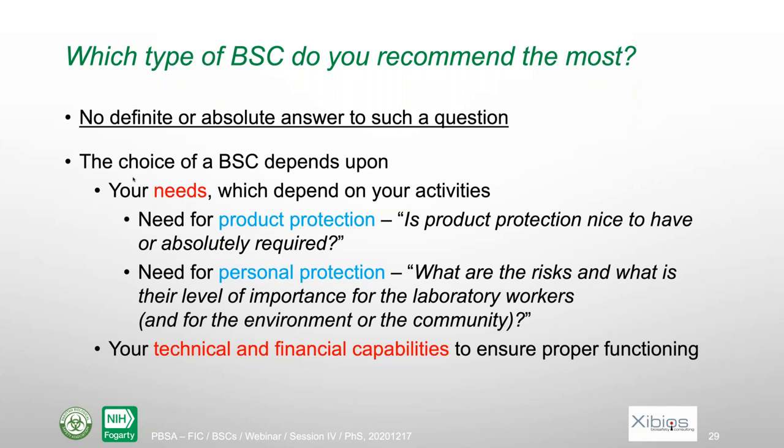And if you answer those two questions, you will have a better idea of what type of biosafety cabinet you will have. You also need to consider your technical and financial capabilities to ensure proper functioning of the biosafety cabinet over time. And so that's also important. So the choice will depend on the activities and also on the capabilities of the different organizations. So there is no absolute answer to such a question.